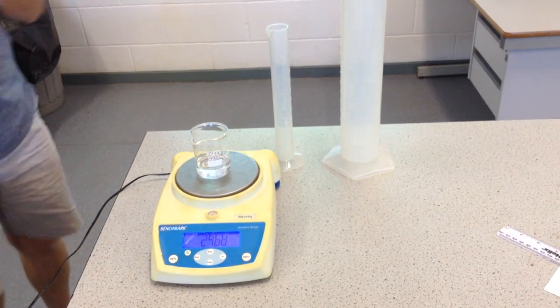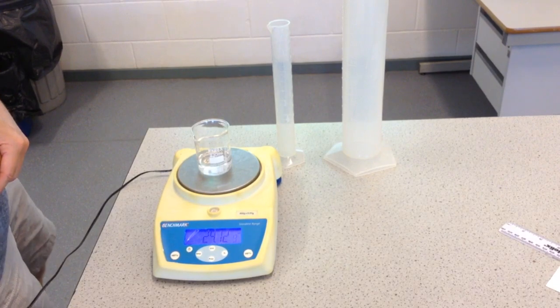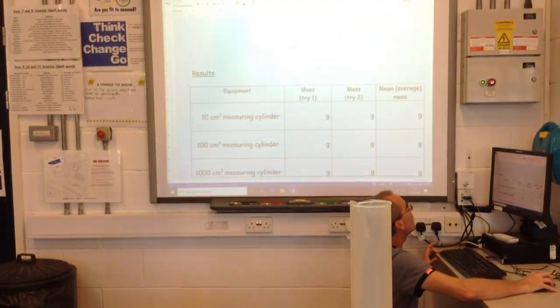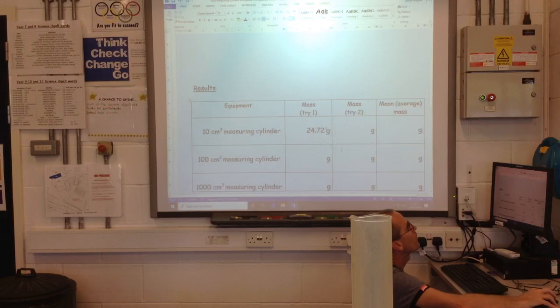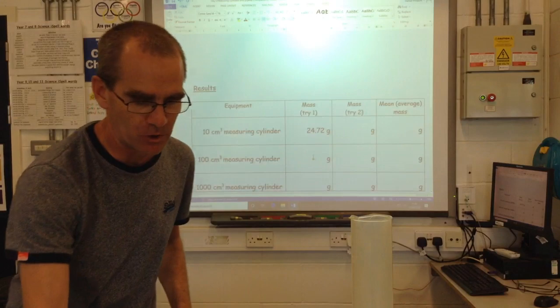I think that's twenty-five. The way to tell would be to look at the balance — twenty-four point seven two grams. Not bad. I've prepared a results table, and with my ten centimetre cubed measuring cylinder, my first go, I've got twenty-four point seven two grams. Normally you would do it a second time and then calculate the average, but I'm going to switch to the one hundred centimetre cubed measuring cylinder.